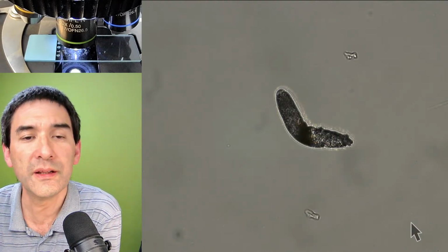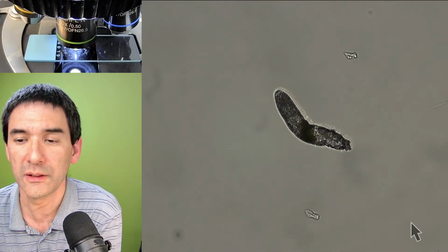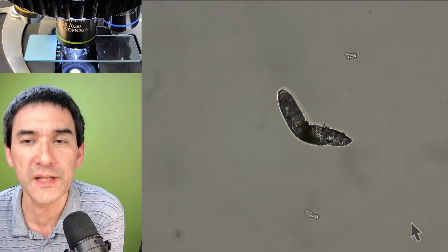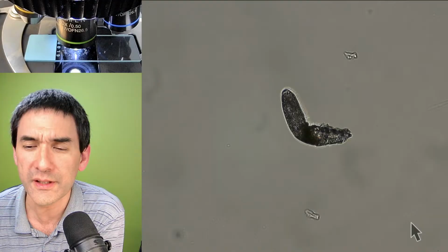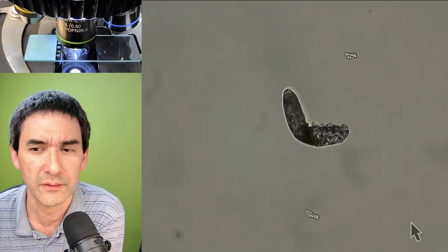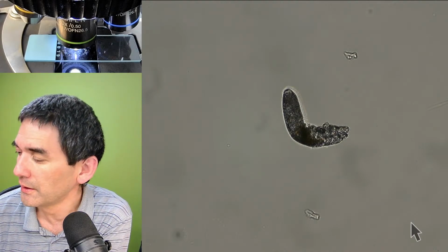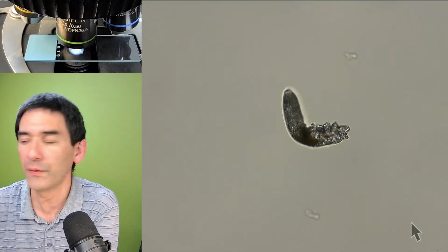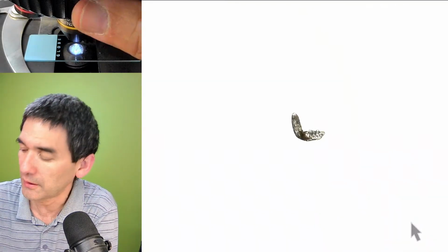So what I would like to do in this case is go up with the magnification yet further, so it means I have to add a cover glass. And there's a question: I wonder if face mites have a skin like tardigrades. Tardigrades, I think, have a skin made of chitin, and I think face mites must have as well. What I would like to do now is have the whole thing look under the high power, and for this reason I need to add a cover glass.